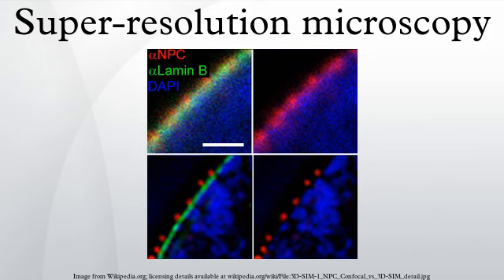History: in 1978, the first theoretical ideas had been developed to break the Abbe limit using a 4-pi microscope as a confocal laser scanning fluorescence microscope, where the light is focused ideally from all sides to a common focus that is used to scan the object by point excitation combined with point-by-point detection. Some of the following information was gathered from a chemistry blog's review of subdiffraction microscopy techniques, Part 1 and Part 2. For a review, see also the reference. In 1986, the super-resolution optical microscope based on stimulated emission was patented by Okhonin.